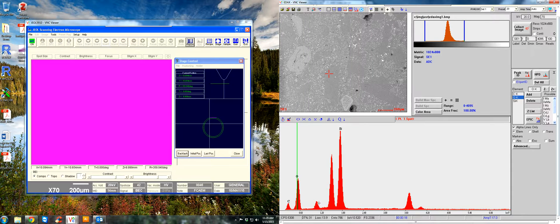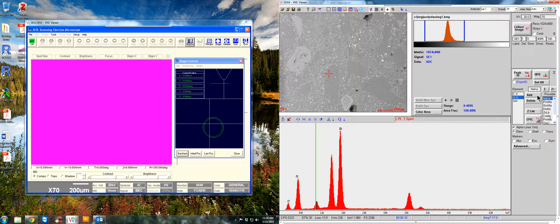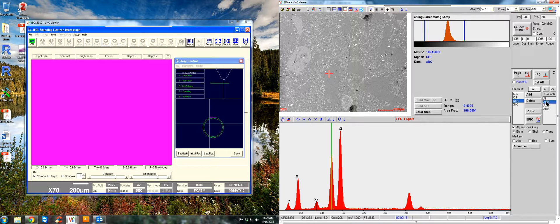So you can either use the mouse to find your peaks manually. This looks like sodium. Or you can, you know, Z-plus and keep going. Magnesium doesn't seem to be there. That looks like aluminum. So we'll add that.